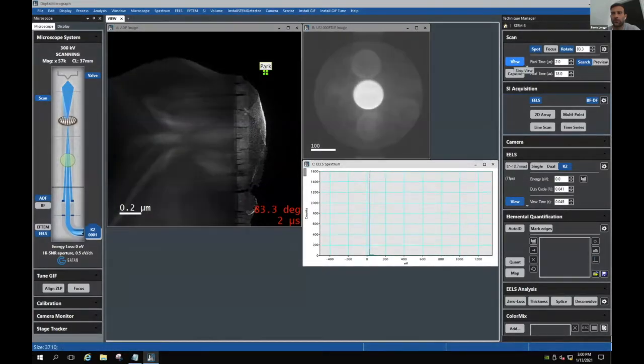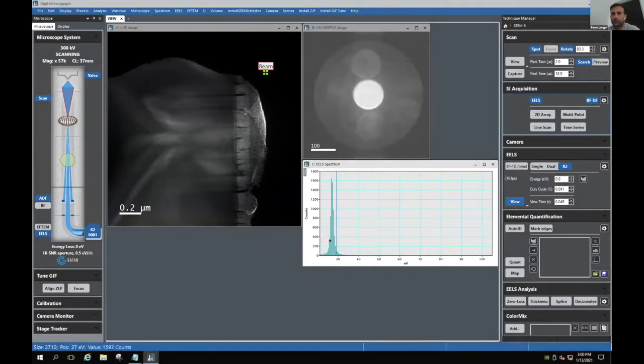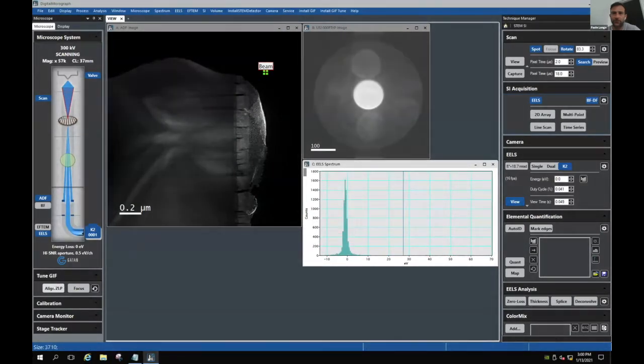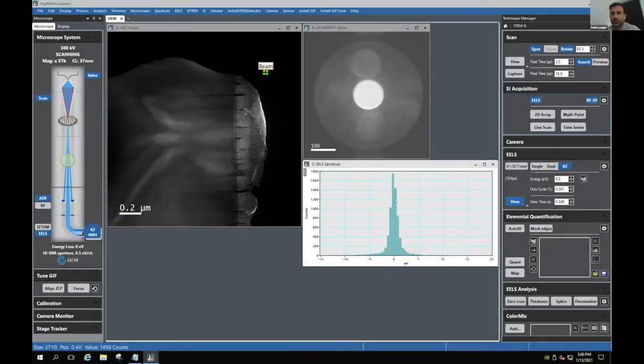So let's stop the beam here so that this is actually clear. Let me put this in the center. Okay. Oh, sorry. So the first thing that you do is bring the zero loss peak to zero. Right now we are not scanning, the beam is in vacuum. Click on align zero loss peak, and this goes to zero. It's probably off just due to the large beam shift we have applied. Yeah, no problem, looks pretty good.